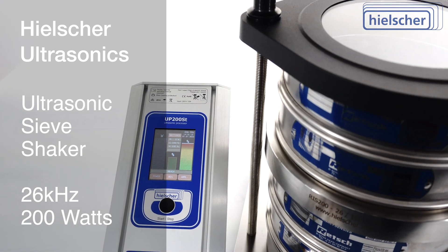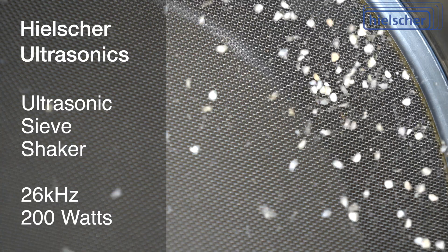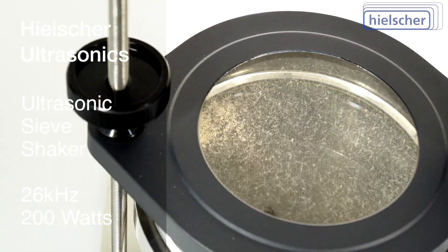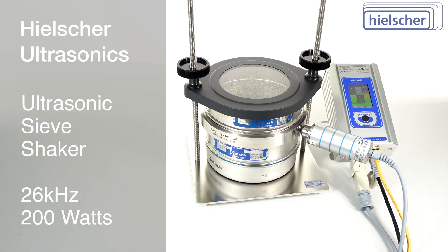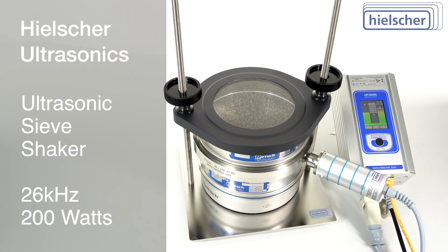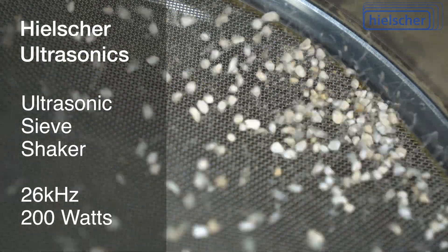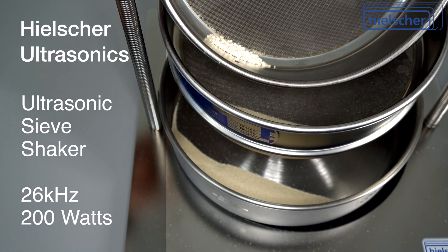This prevents your material from being abraded. Especially with abrasive powders, conventional sieve shakers also cause strong abrasive wear of the sieve mesh itself. With the Hielscher ultrasonic sieve shaker, you can use your sieves much longer. The ultrasonic vibrations activate the entire sieve surface, right to the edge, leading to more accurate sieving results.